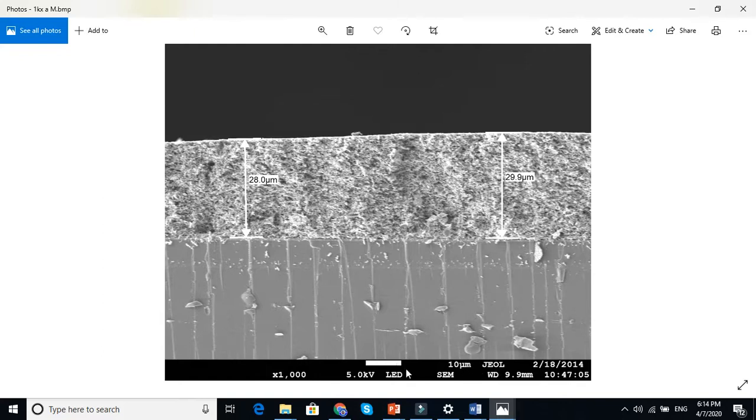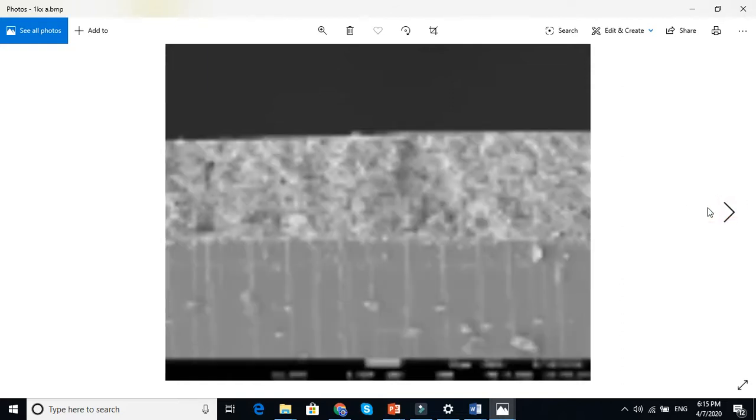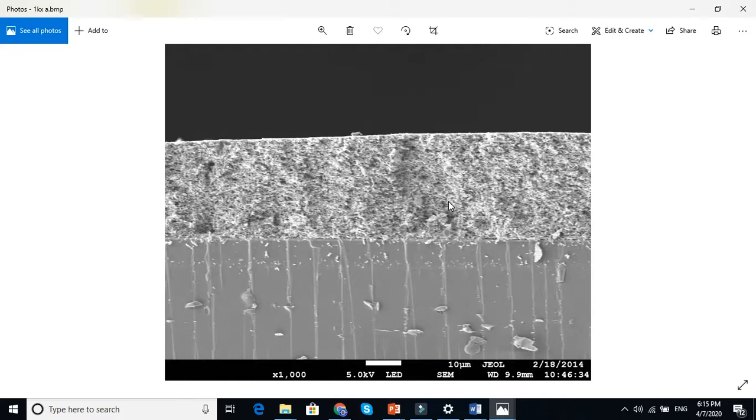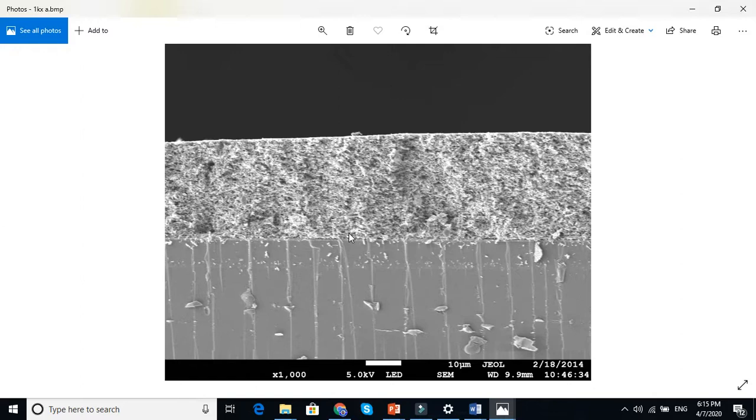So if you don't have the bars, and if the examiner asks you during the interview or during the defense that if these bars are not there, for instance, and if they ask you something like this, then what do you guess about the dimension, the thickness of this layer? So you can easily say, if you take this one and this computer, this is almost 30 in micrometer.